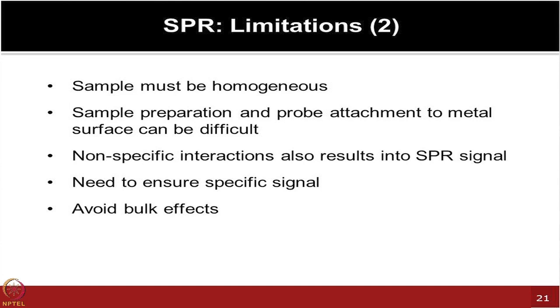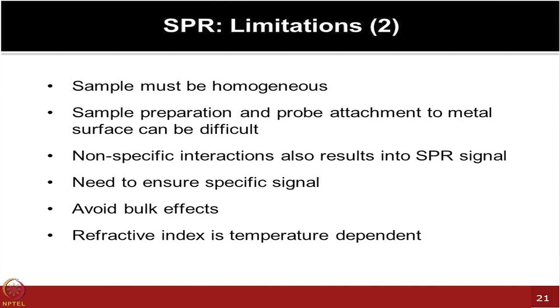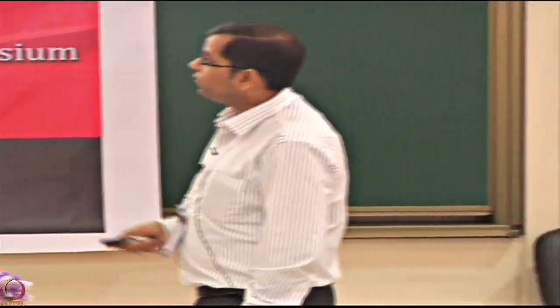Of course, in the field of label-free technologies, you have to ensure that the binding you are seeing is actually real binding and not artifacts. Sometimes a reaction happens in a temperature-dependent manner, so you have to play with that too. Fortunately, some of these instruments and technologies now give you a range from 4 degrees, and you can vary up to 37 or even 50 degrees to try out different conditions.